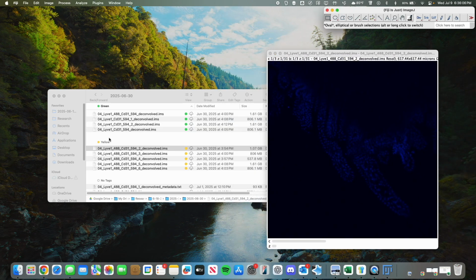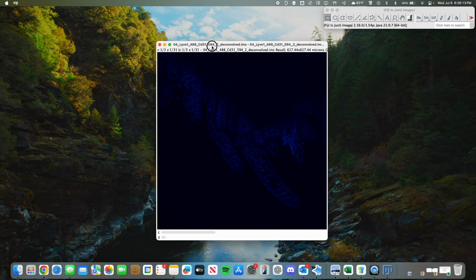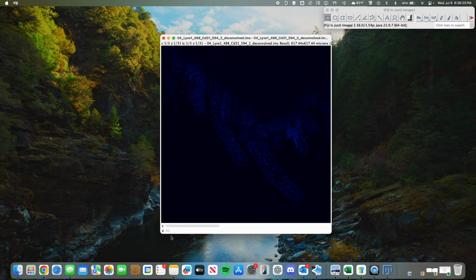So we're going to do the same thing that we did last time. All I've done is open up this file, which is for quantifying lacteals. This is just another type of file that I received, and we're using the deconvolved version as it has opened properly. It's a similar setup to the last image. We have all 3 channels here. Once again, we're only really going to need 2 of the channels as we're measuring the lacteal versus the villus, which is shown in blue here.